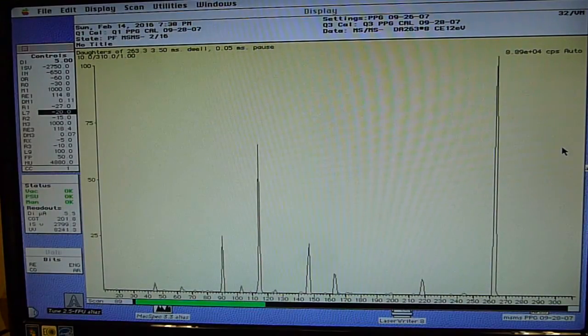This will probably take another minute and a half. We'll close this run at, say, scan 200. Counts are already starting to go down. Good.